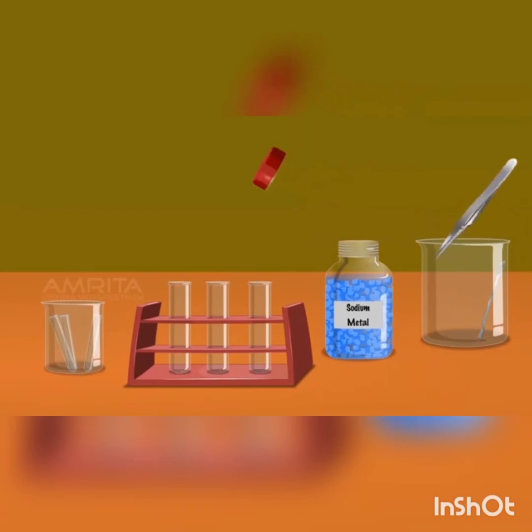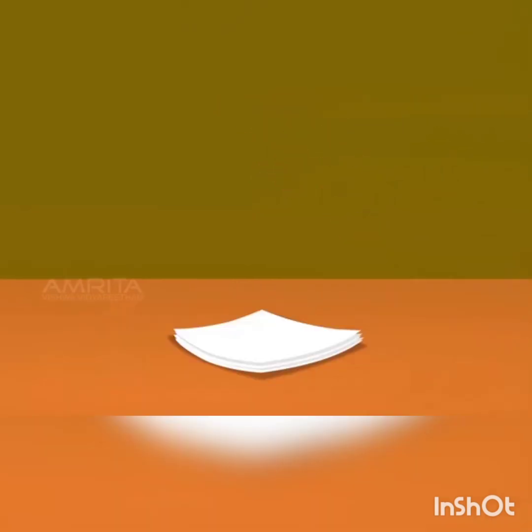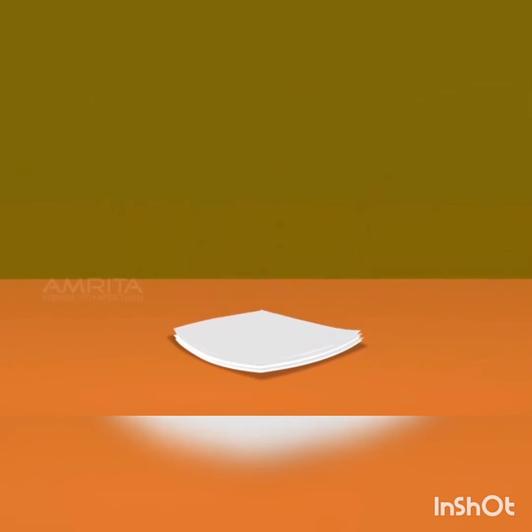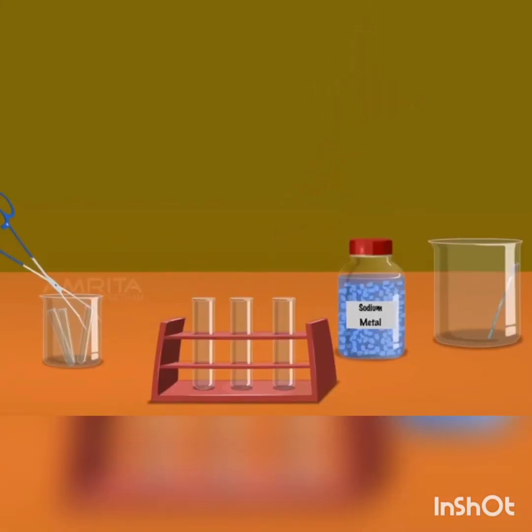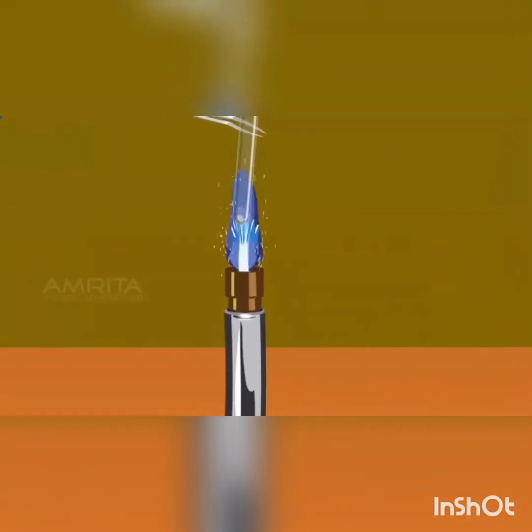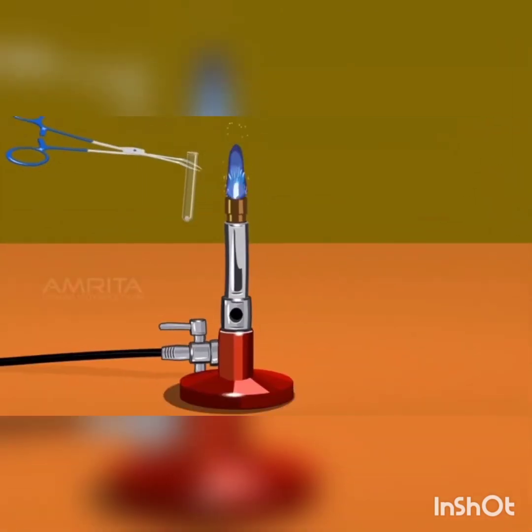Take a small piece of sodium metal using the forceps. Place the sodium metal piece on the filter paper and dry it by pressing it with another filter paper. Take dry sodium using the forceps. Hold a fusion tube using tongs and put the dry sodium in it. Heat the fusion tube slightly over the Bunsen burner so that the sodium melts to a shining globule.